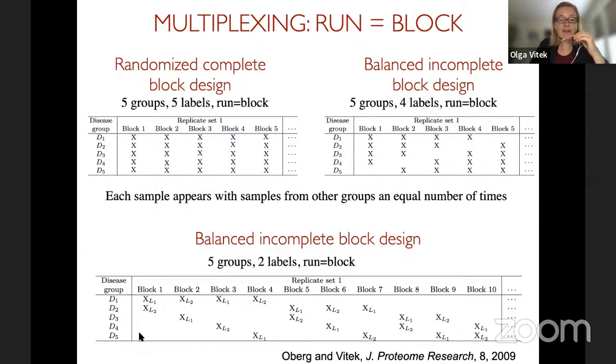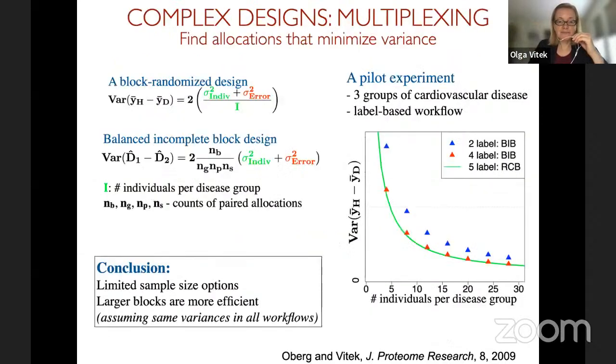In particular, the reference sample, for example, in SILAC, you can imagine spiking reference peptides for every endogenous run. So this is actually less effective from the statistical perspective than doing this type of balanced design. And so this is how statisticians will think about that.